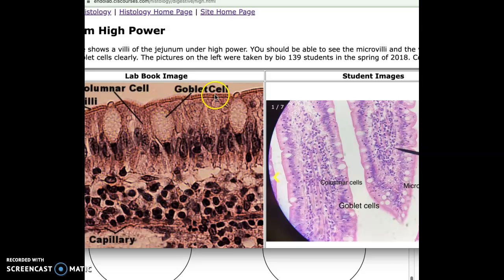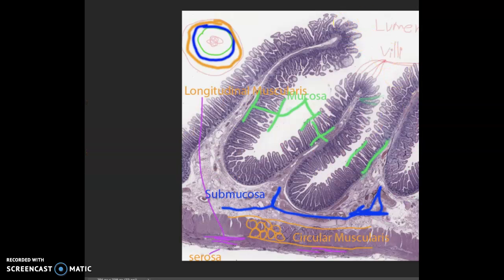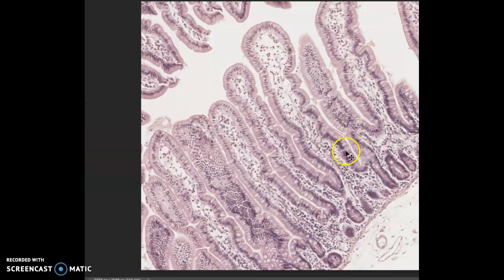And then, I believe there's microvilli on that slide. So this would be microvilli. So here is the 400 time. Nope, no microvilli.